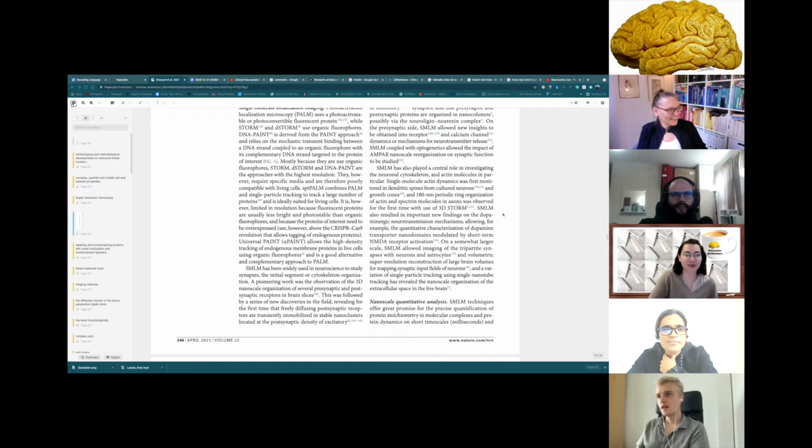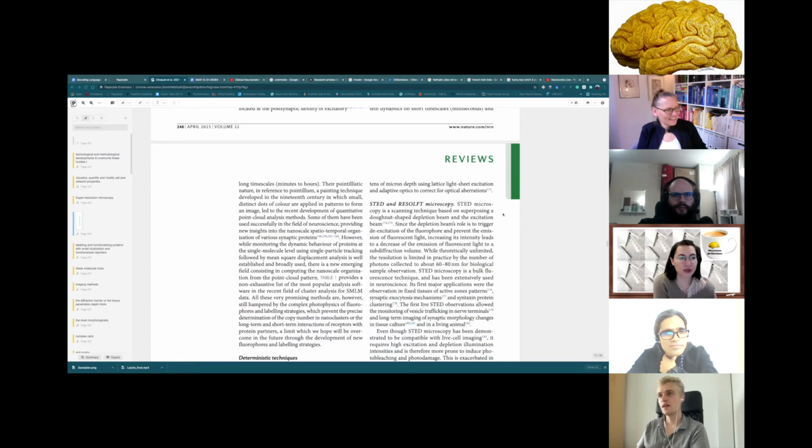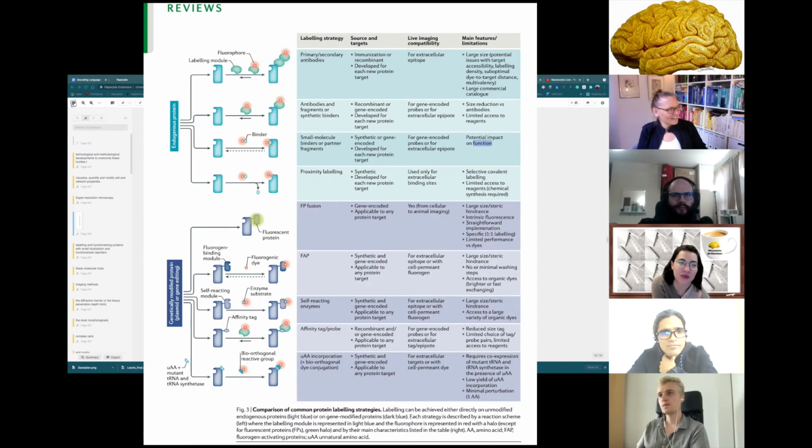I was looking at figure 3, where you have all the protein labeling strategies. And I was wondering, also in neuroimaging, we always have the question, which is the gold standard. And I think also here, when you see all these techniques, it's super resolution, but there is also a lot of diversity. And so maybe you see which is the golden one, which is the best one.